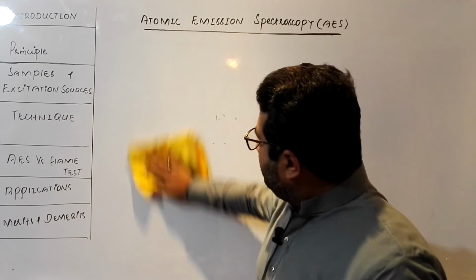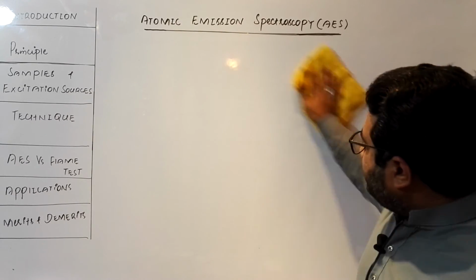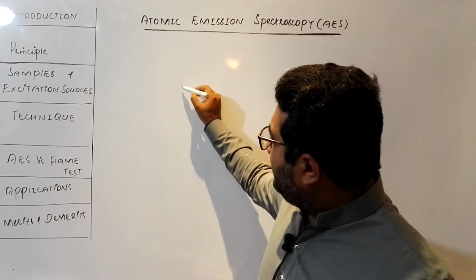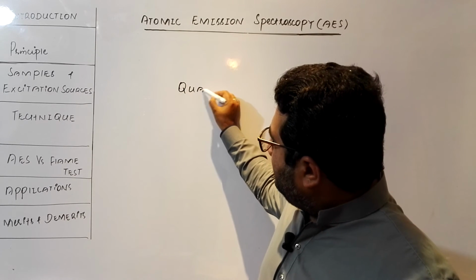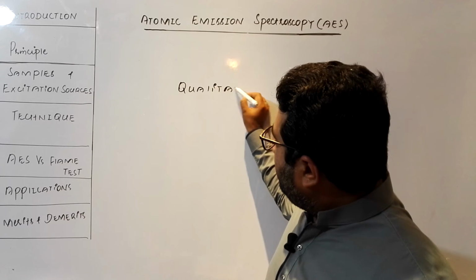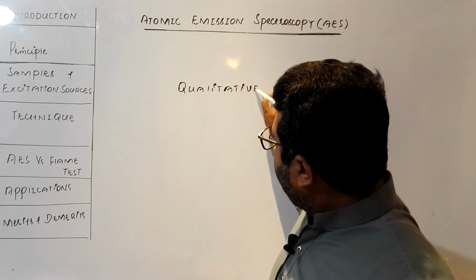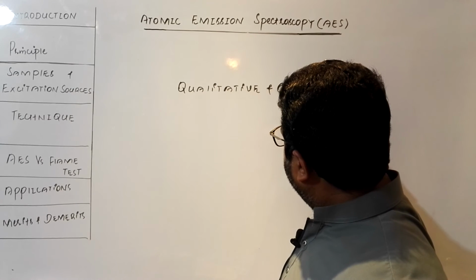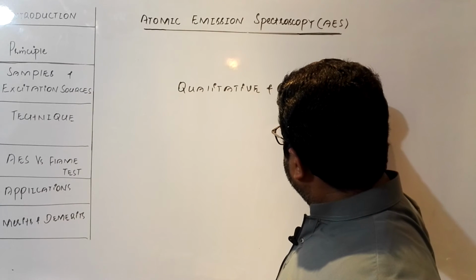Now what are the applications of atomic emission spectroscopy? Atomic emission spectroscopy is basically qualitative and quantitative. How?